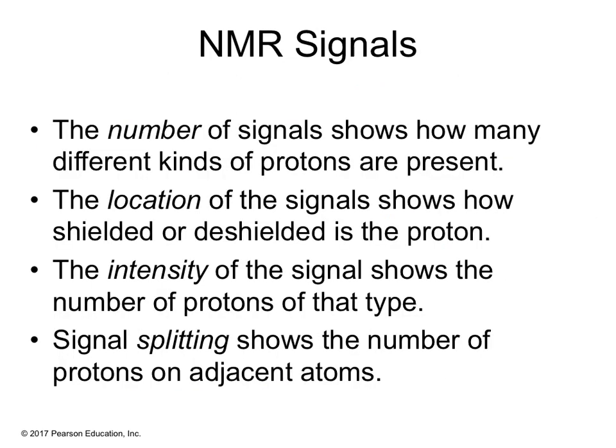Okay, so I want you to understand 4 things about the NMR signal. 1, so this is an important slide, the different kinds of protons present. So we're going to look at structure, and we're going to ask ourselves, how many NMR peaks?